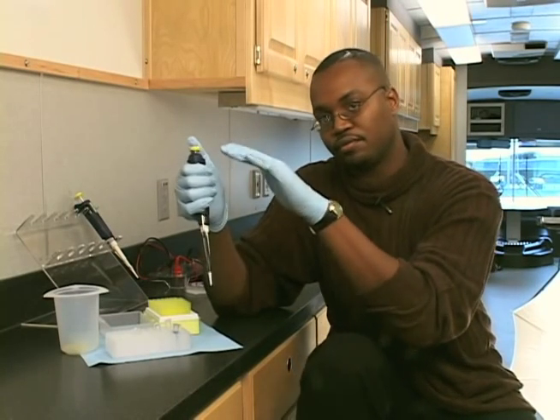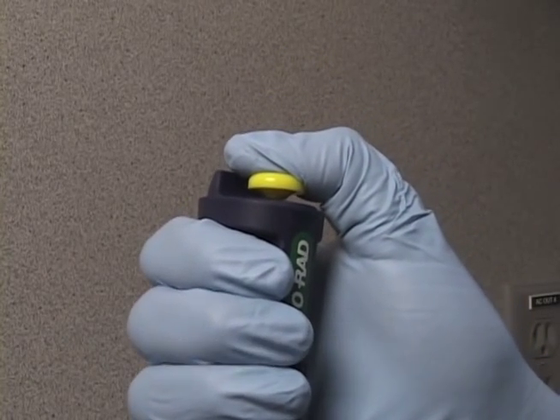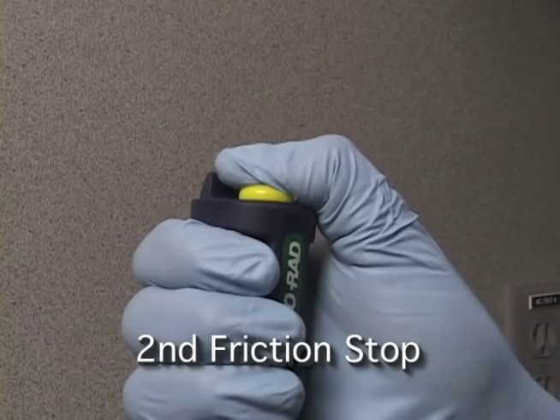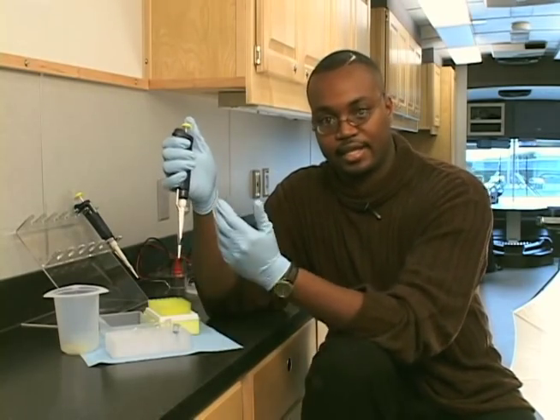The plunger has two friction stops. If you press down once, that's the first friction stop. You press down again, that's the second friction stop, and that's going to be used to control liquids going in and out of the pipette.